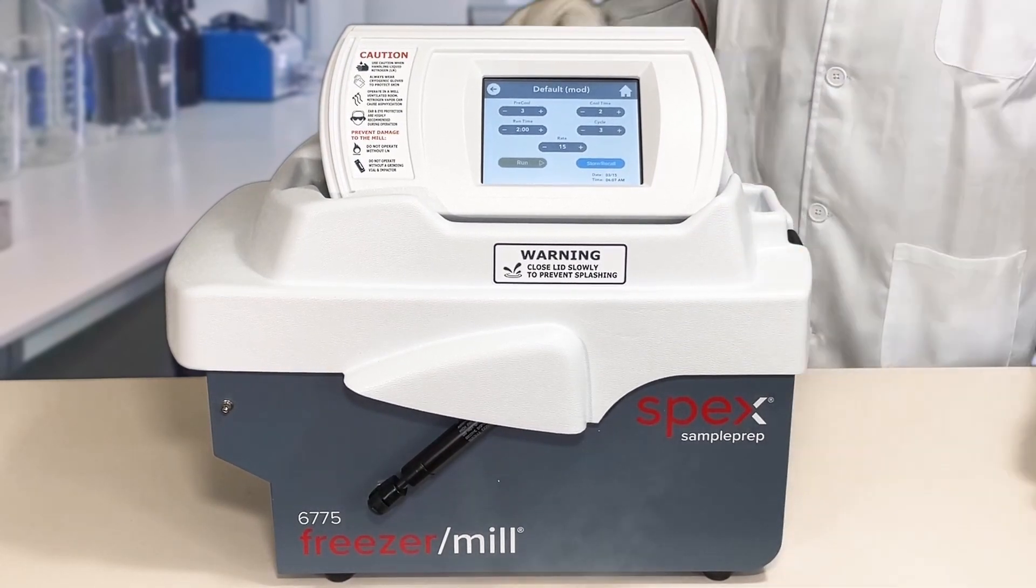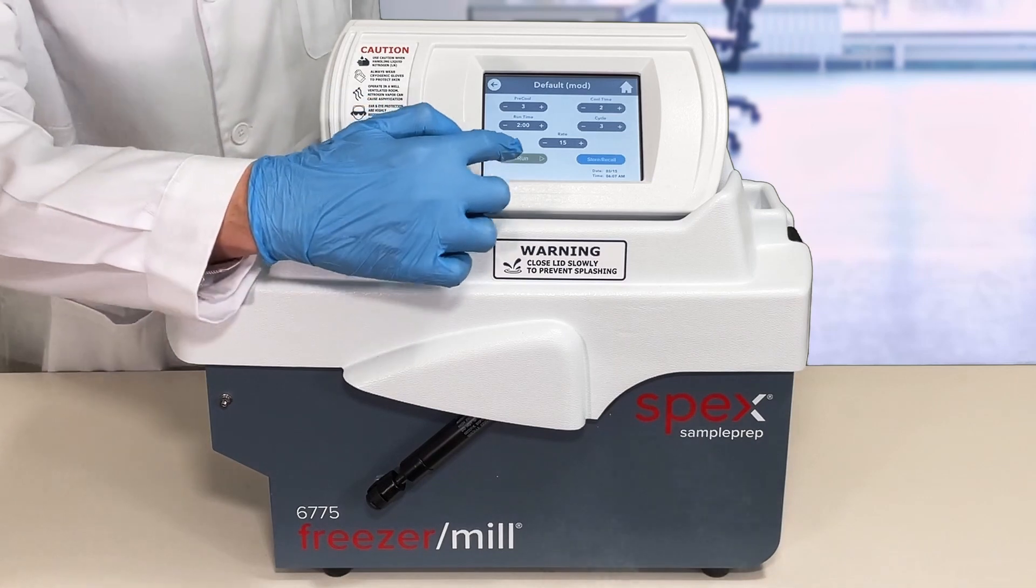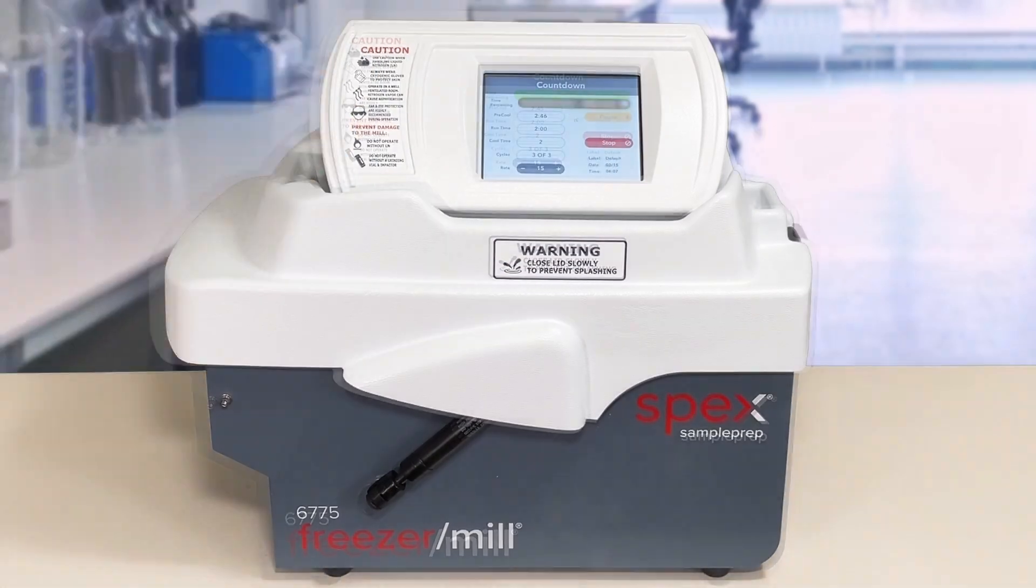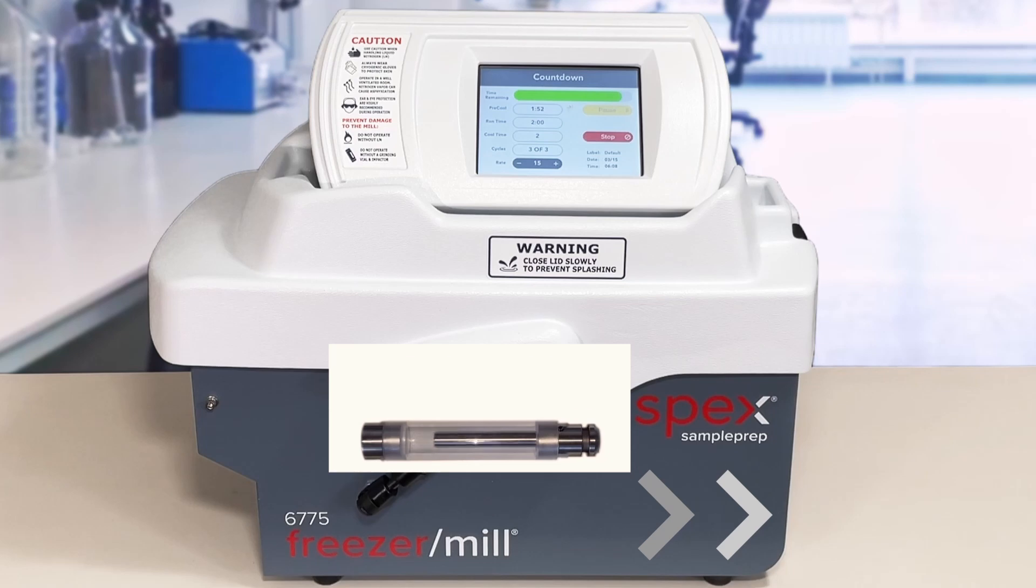You can then start your pre-defined program. The outside of the milling vial is stationary while an electromagnet hits the impactor back and forth.